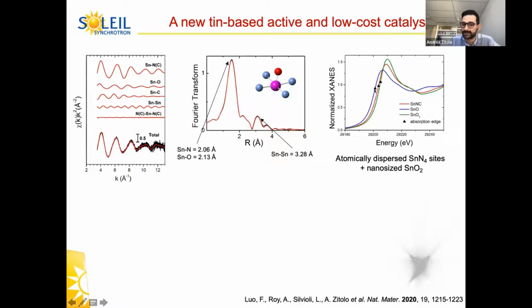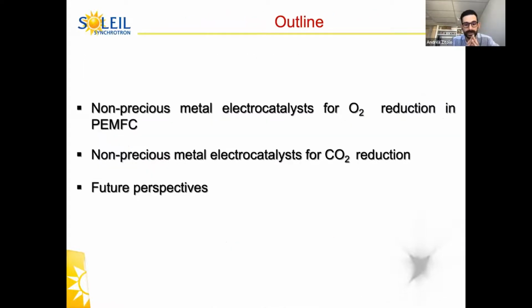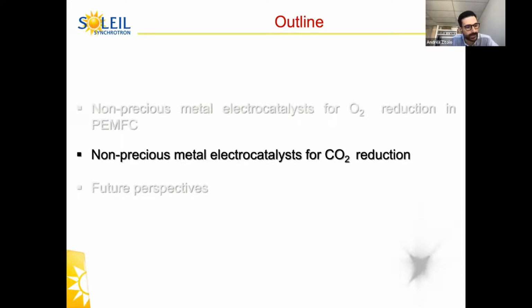And the coexistence of tin 2 and tin 4 species is also supported by the absorption edge position of the XANES spectra. Of course, this is also supported by Mossbauer spectroscopy, which identifies the presence of tin oxides and the coordination between tin and nitrogen. Okay, so with this example, I conclude the oxygen reduction reaction. And now I'd like to show you how these materials can also be used for CO2 valorization.